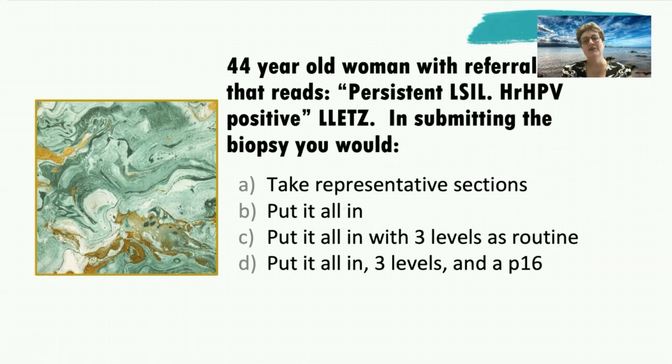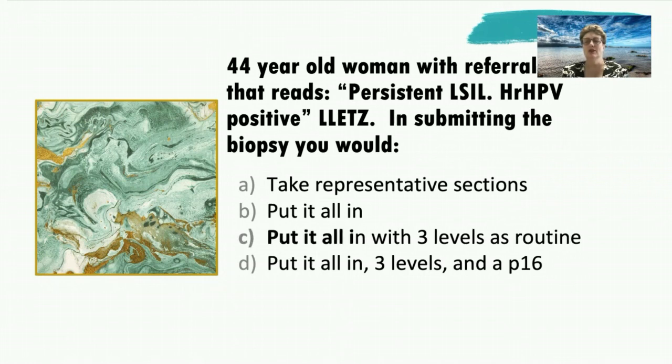If you have a 44-year-old woman with a referral that reads persistent LSIL, high-risk HPV positive, and then getting a LLETZ, when you put in the biopsy, what would you do? It partly depends on what the usual protocol in your lab is, but acceptable answers include put it all in with 3 levels as routine, as is done in our lab, or in some other labs, there might be a P16 put in.